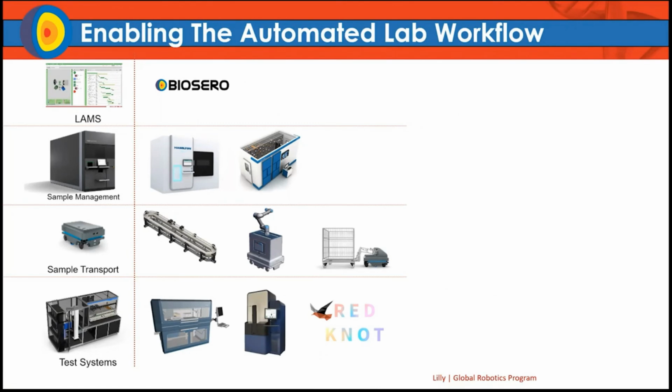At this level, we're scheduling the assays for the entire lab, we're collecting data from those assays and sending them to our LIMS systems. Our electronic lab notebooks are also sending the necessary data for specific assays. Specialized dashboards will also be utilized to inform lab leaders or operators of the status of particular samples, and data will also be stored in data lakes for future trending and analysis.